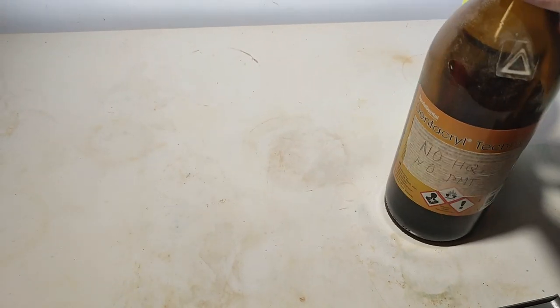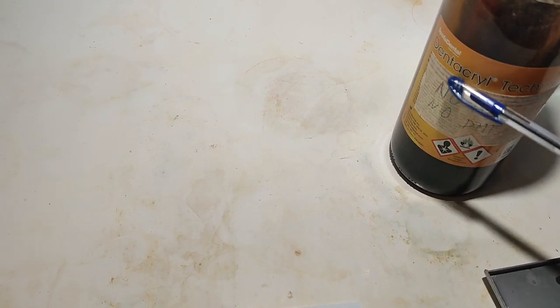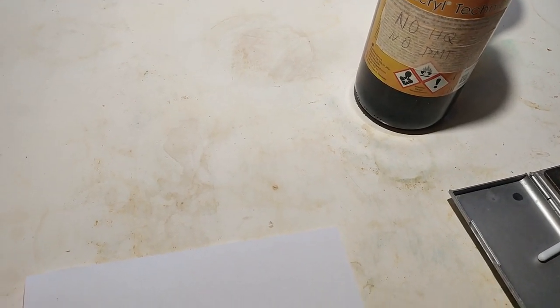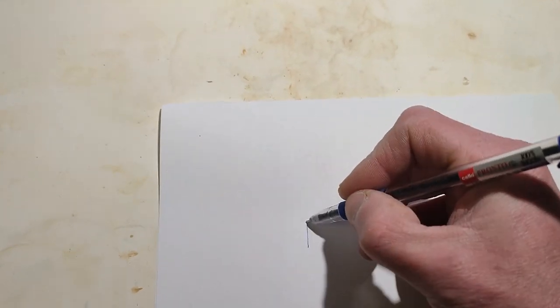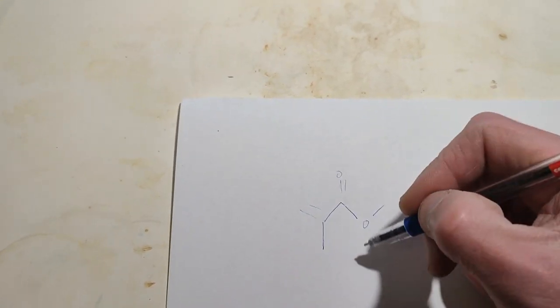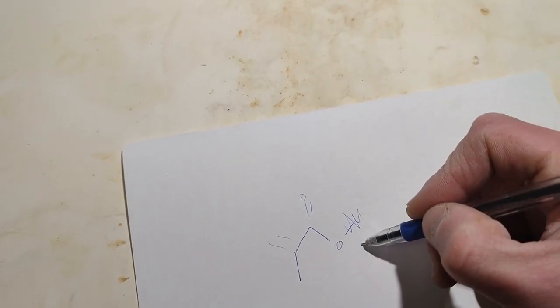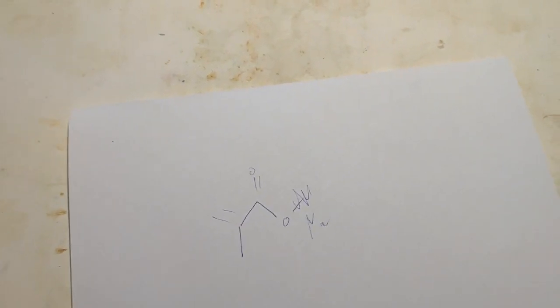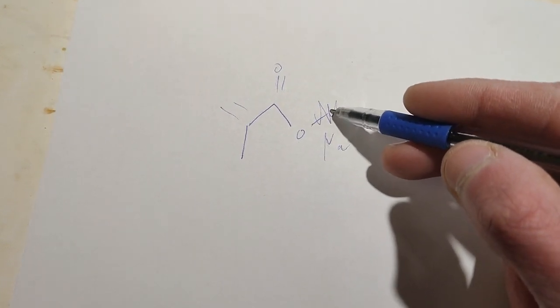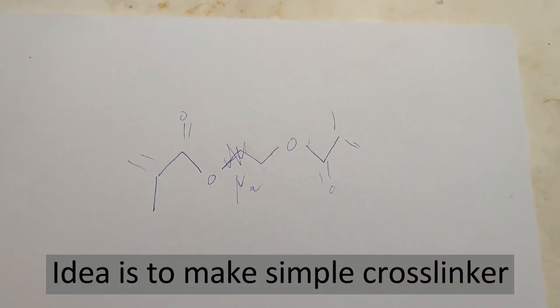So here I have this methyl methacrylate, and let me explain. Basically, what I want to do is hydrolyze this stuff to remove the methyl group. I want to do this: remove this thing away, and attach some sodium ion there. So I can then acidify this thing and form another bond instead of the methyl group with something else. Probably stuff will be flipped around somehow, but anyway.